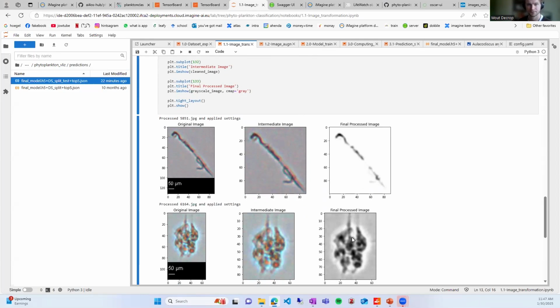Thanks, Wout. And then there's one question back in the chat from Jens. How do you pick out only the uncertain ones, the human interference, how to look at images to inspect the not sure images? How do you look back for every image?